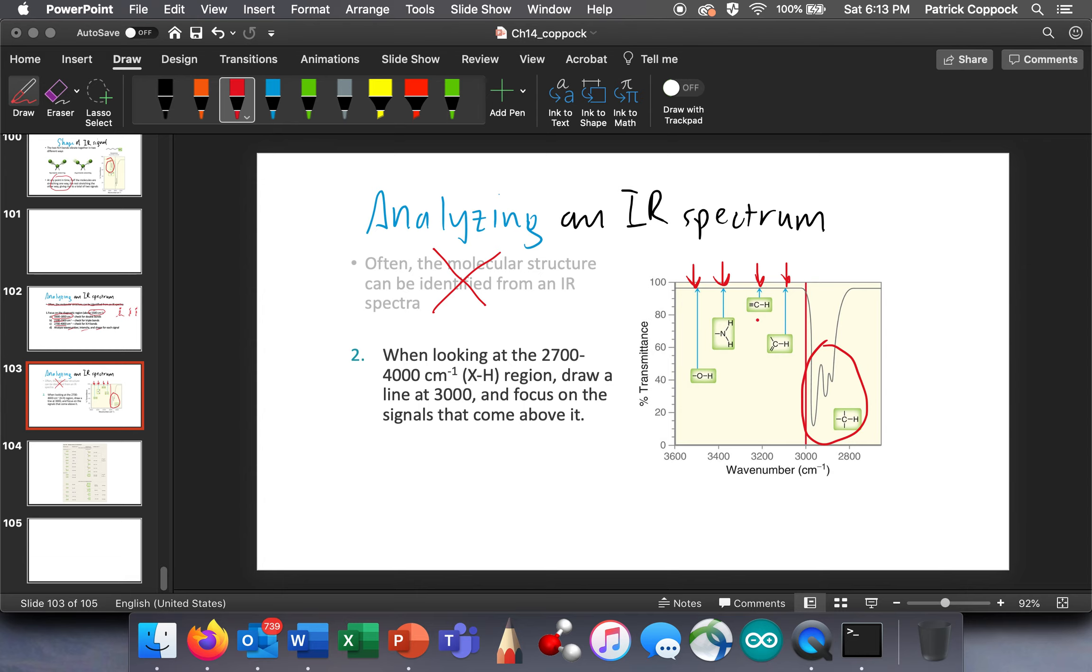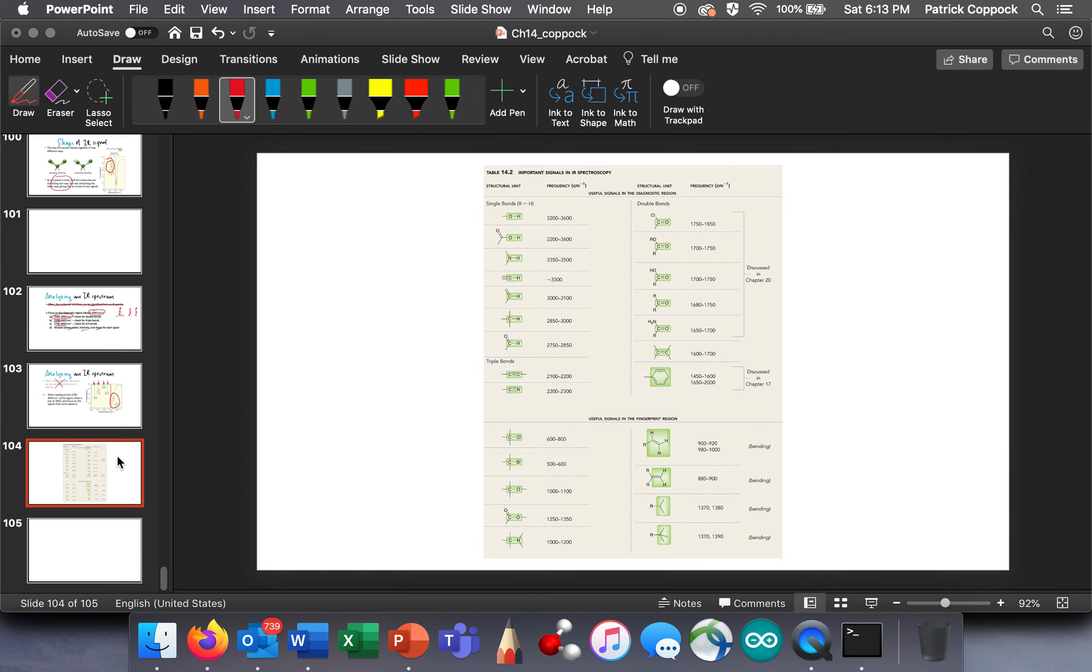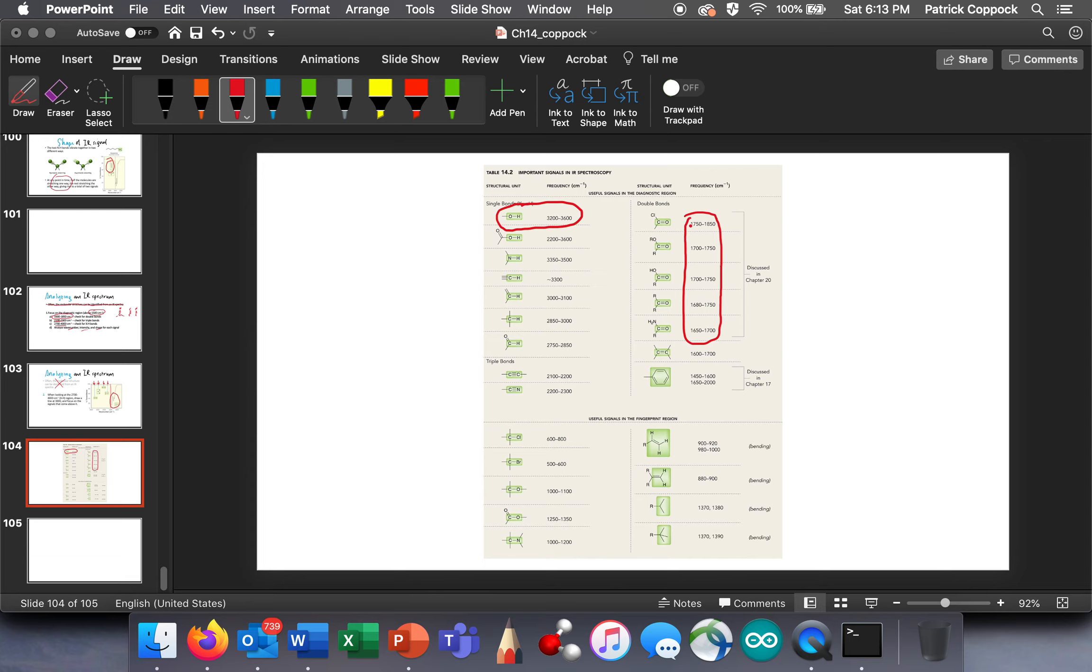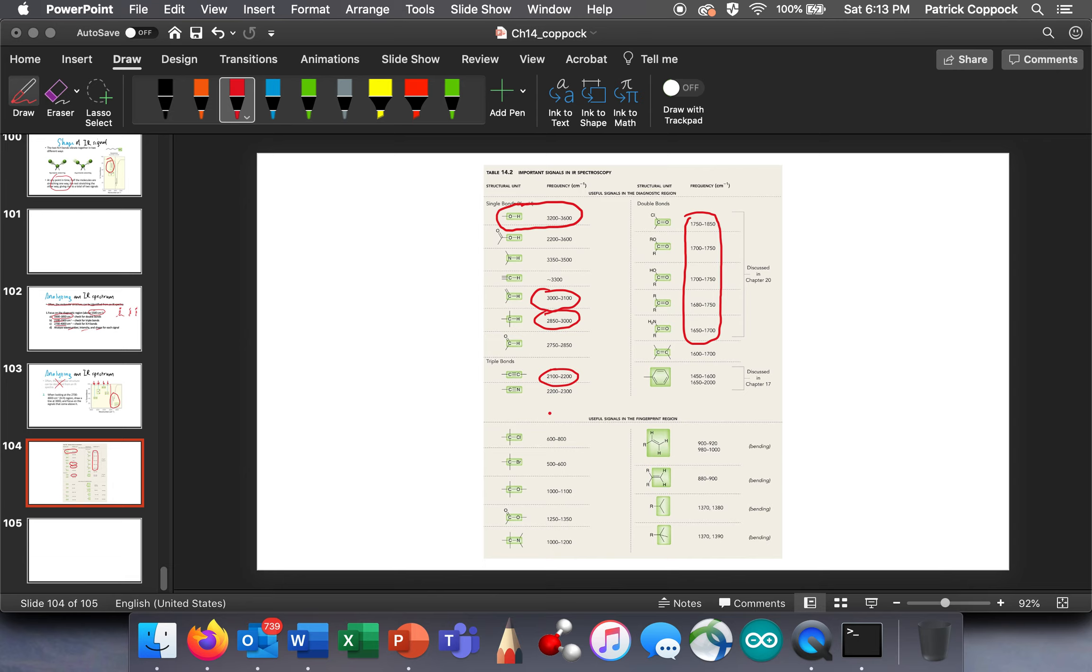And finally, I would like to close this video out with pointing out that we're always going to have access to a table. This is not something you need to memorize. But when we point some things out, we've discussed almost ad nauseam, that OHs are going to absorb somewhere around 3400. Carbonyls are going to absorb at 1700. Look at that, all those carbonyls at 1700. And triple bonds are going to be there. And the CHs are going to be there. Alkenyls are going to be here. So this is a table that you'll always have with you.